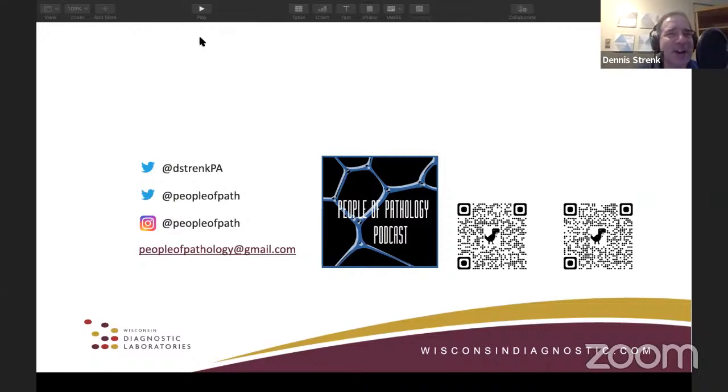That's a good question. I know I don't. That's just something that I've always heard forever, and everybody kind of has that same mindset about it. The one section per centimeter. That's an interesting question. I think I'll look that up and see if I can find an actual reference for that. So yeah, with that 1 centimeter rule, I just want to add, and Mr.